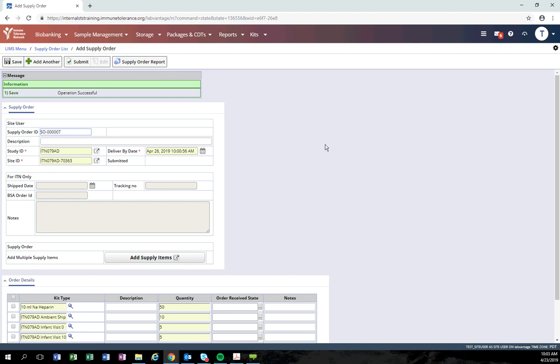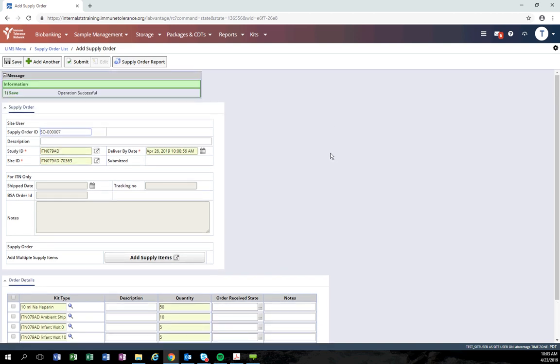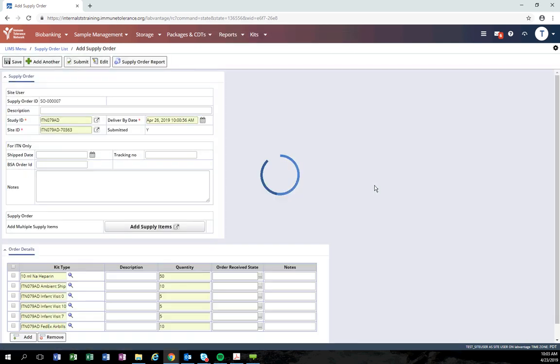Once you have confirmed all items are appropriate and ready to be submitted, click the submit button. By clicking the submit button, this will send an email notification to the ITN to notify us that a new order has been added.